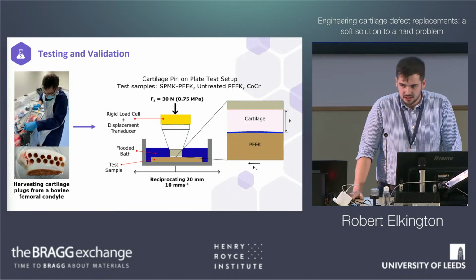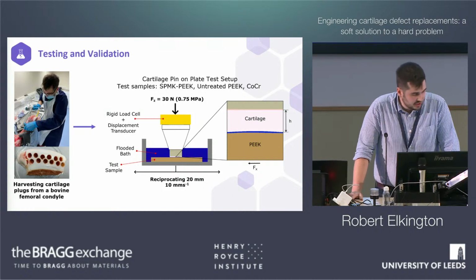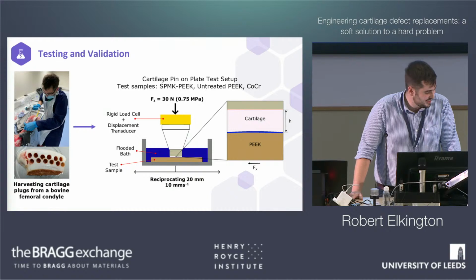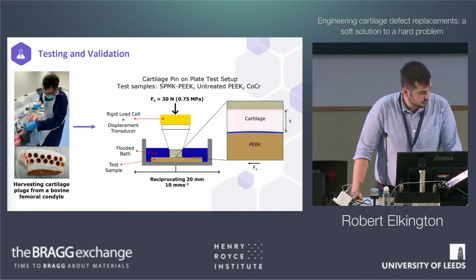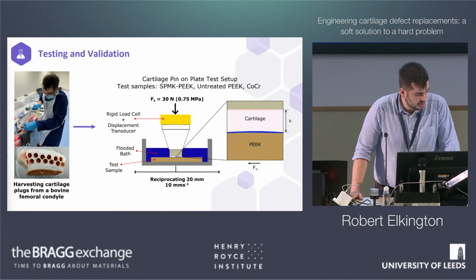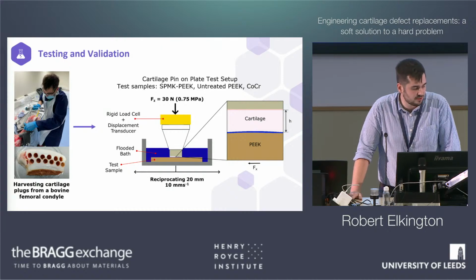So we're going to start to try and test and validate these against cartilage, and we're going to test our theory. Is this a functional material? So there I am harvesting some cartilage off a cow knee. It's not a great job. And then on the bottom, that's femoral condyle, and we've drilled cartilage plugs out of this, about 8 mil in diameter, and these are all flat plugs.